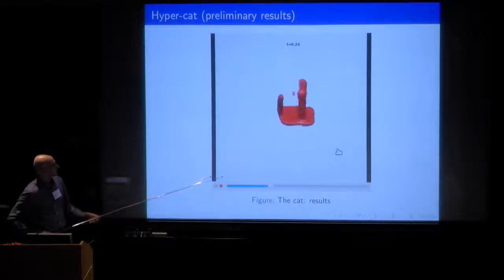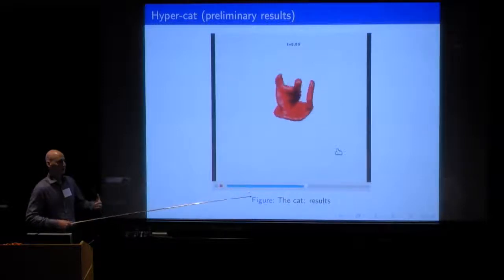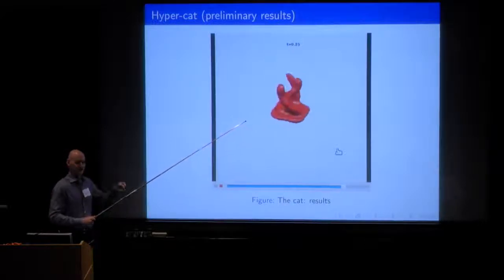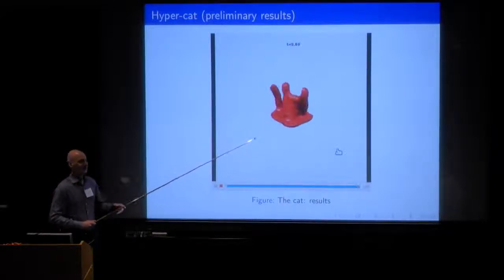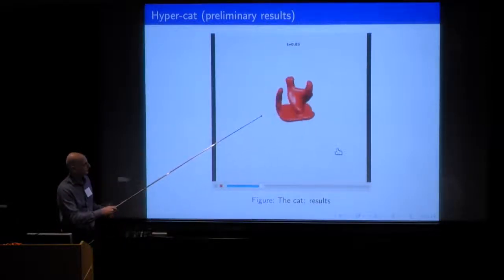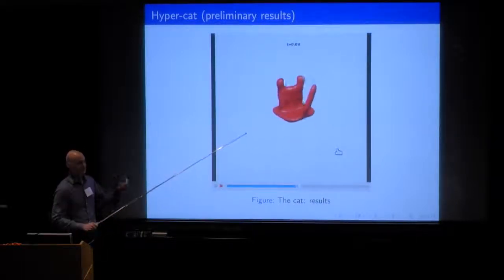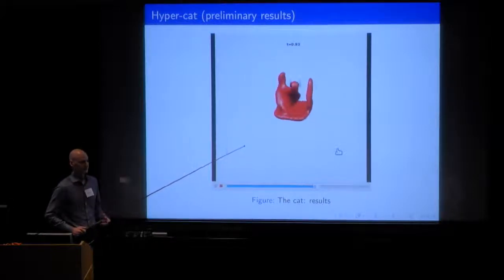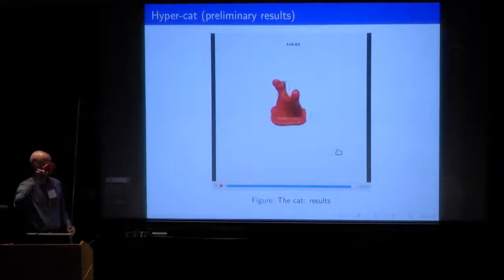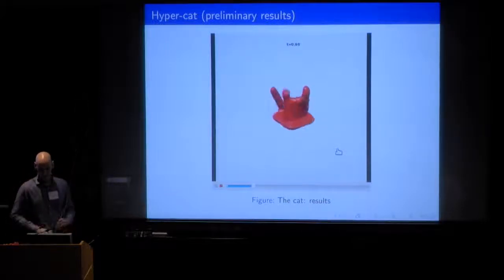This is what comes out of the reconstruction of this four-dimensional cat, and what we're looking at is three-dimensional slices of the four-dimensional cat. We can characterize the movement. It's interesting that it's aligned in a different way; that's an ambiguity that's naturally created. And these are printouts of the 3D slices of the four-dimensional cats. Unfortunately, we don't have 4D printers yet.